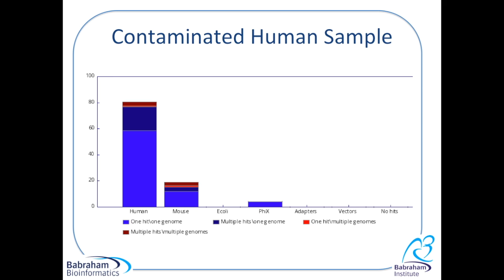You can also see in the fourth column there are a small number of reads which map only to the Phi X genome. This could be contamination, however it is quite common when performing a sequencing experiment to add a small quantity of Phi X. This actually, in some instances, improves the base calling of the sequencing machine. And I suspect that is what has happened in this case.